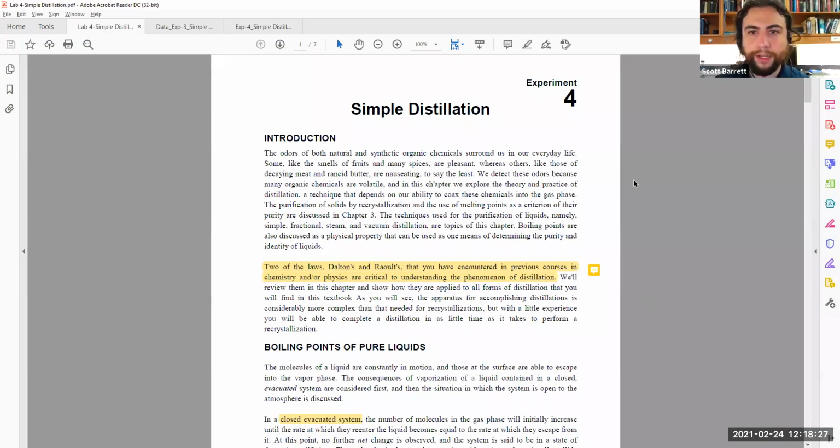Next, we will be going over into the actual lab manual, and I've gone through and, getting a little better at this now, taken some notes that I can share with everyone to assist. I think this will help everyone out a little bit more with their clarification. So here the introduction is a brief introduction just giving an idea of extracting samples, recrystallization and melting points.